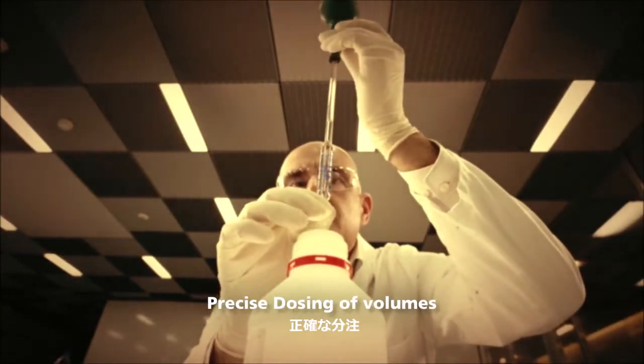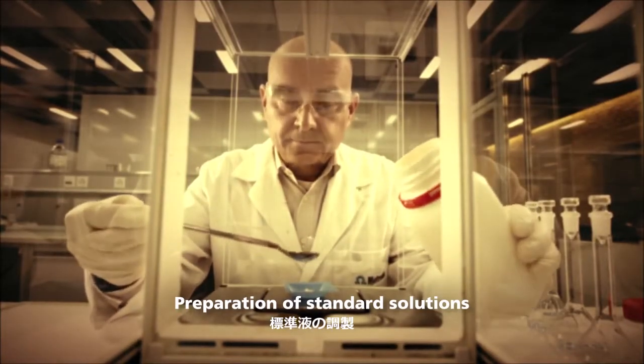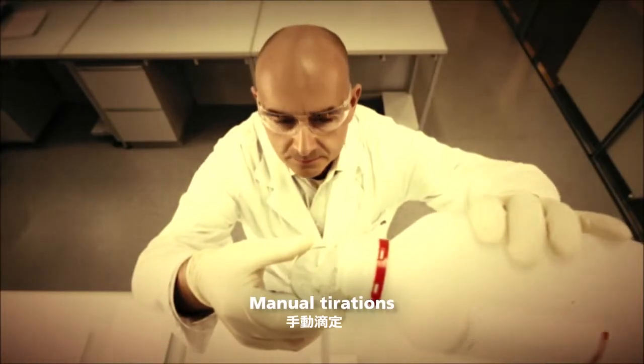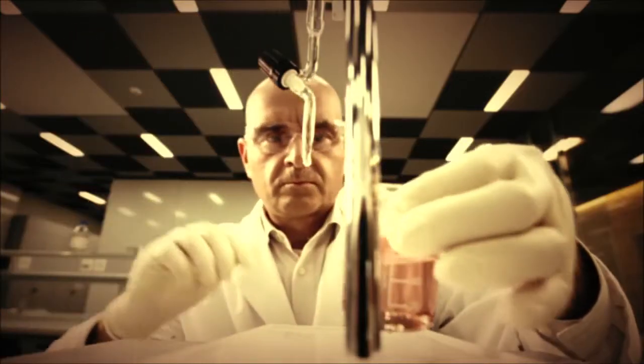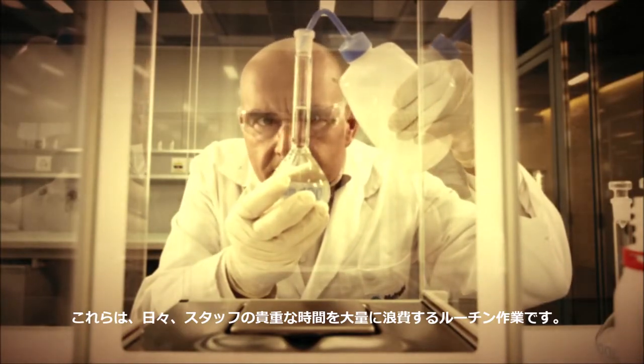Precise dosing of volumes, preparation of standard solutions, controlling of synthesis, manual titrations. These are routine processes wasting much of your staff's precious time every day.